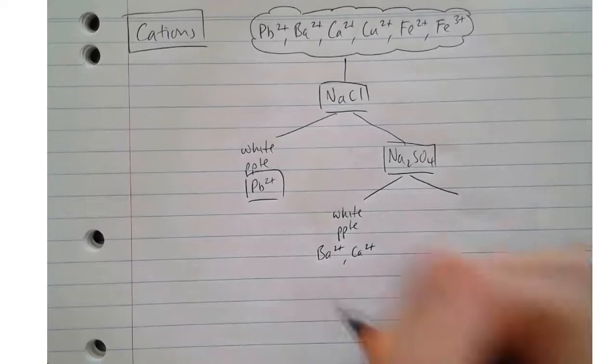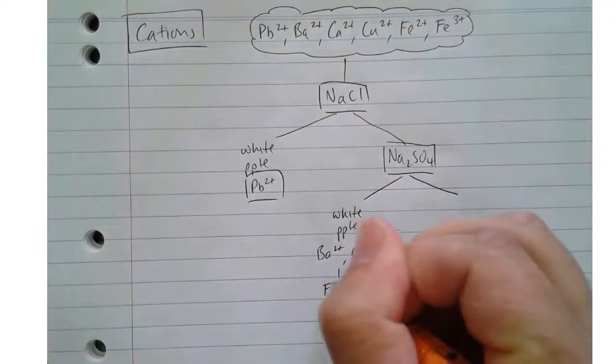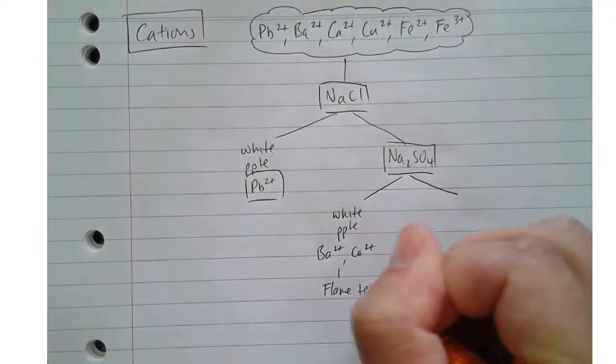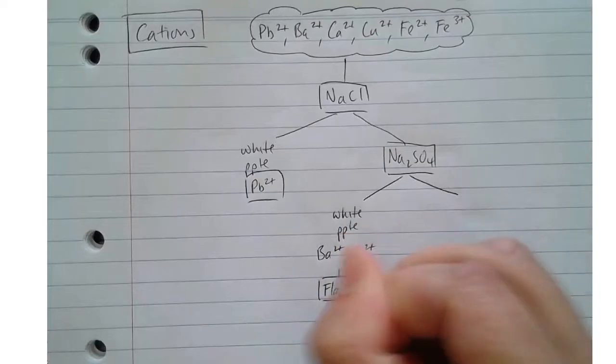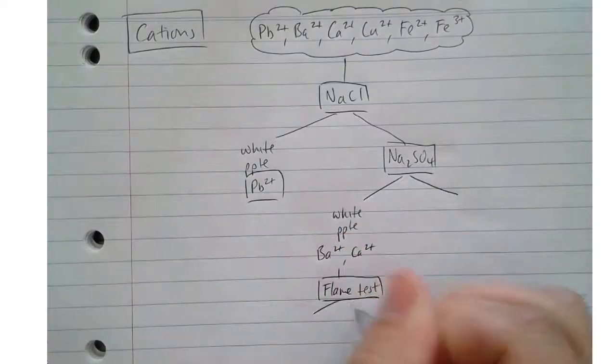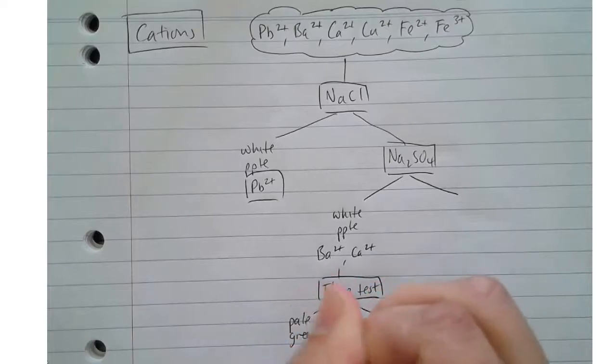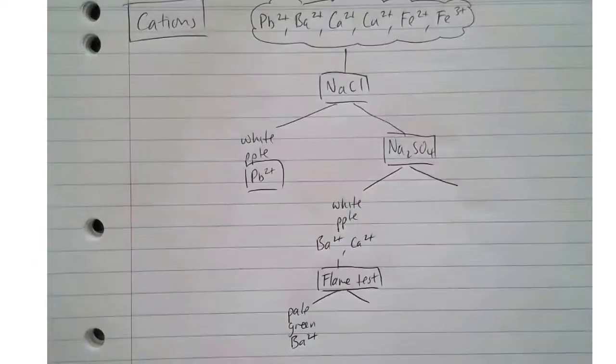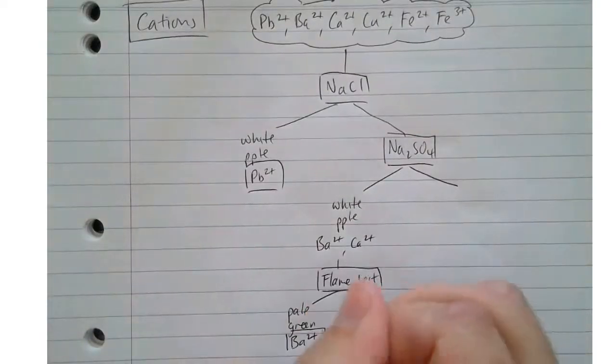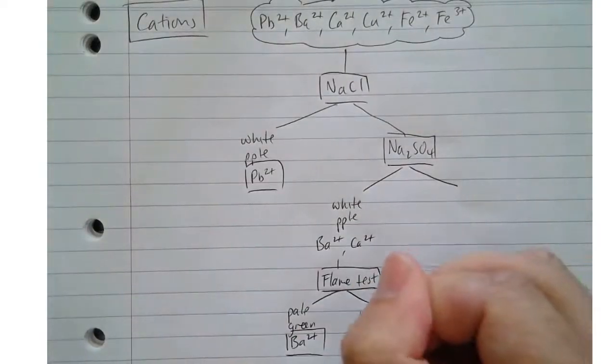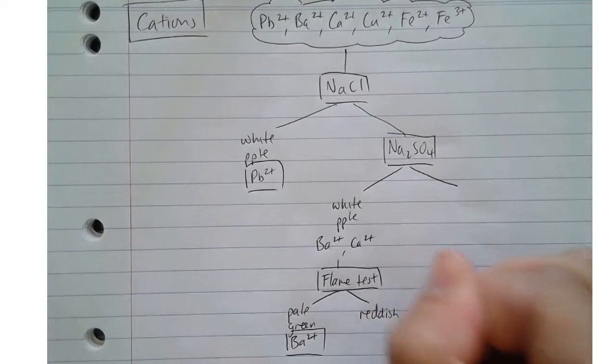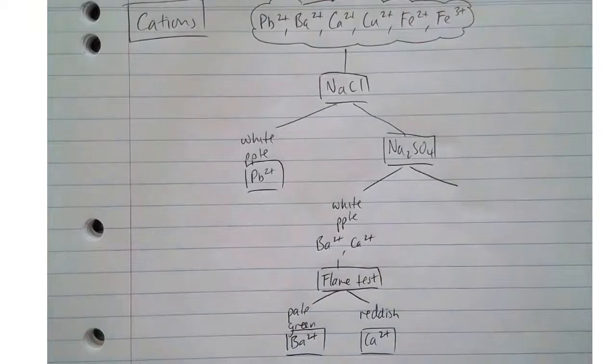So what we can do then to identify barium and calcium is do a flame test. We put samples of them in a flame, and we get pale green is barium, so I'll slide it up just a little bit, and a reddish colour is our calcium. So we can use that to identify.